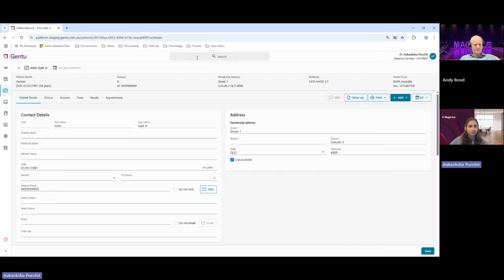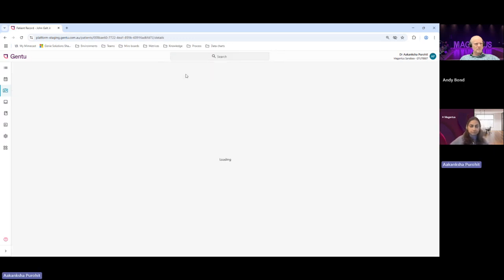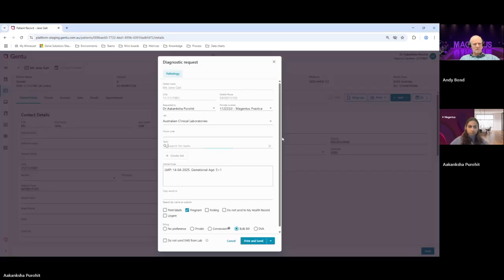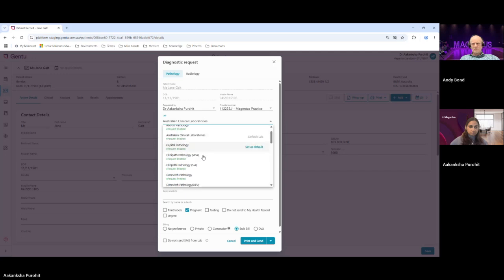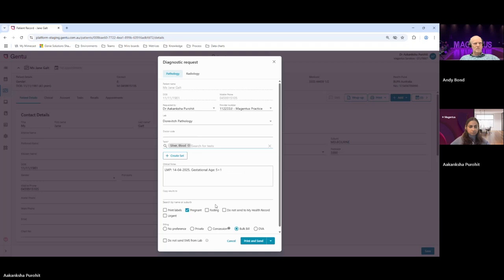I'll create another request in parallel for another patient. All the clinical information, pregnancy information, that's already pre-populated in here, and that will go along with the request. This request is for Jane for Healius pathologies.